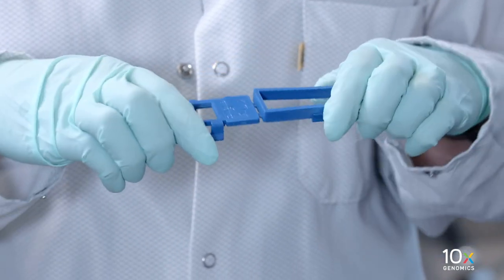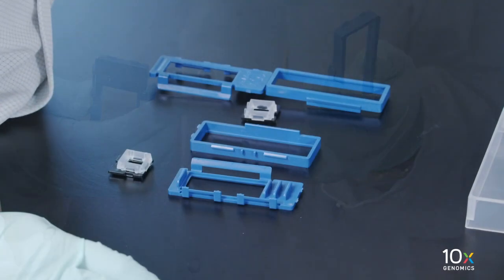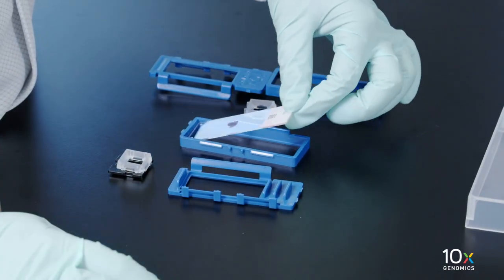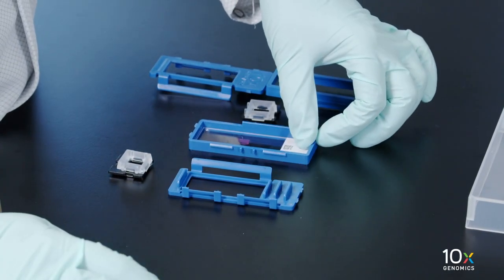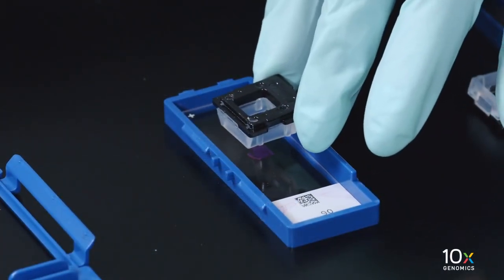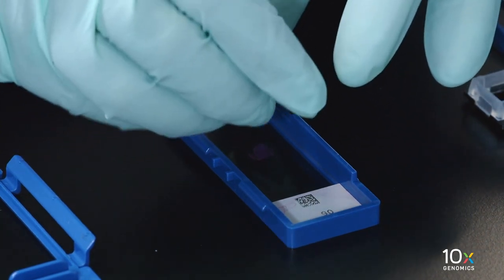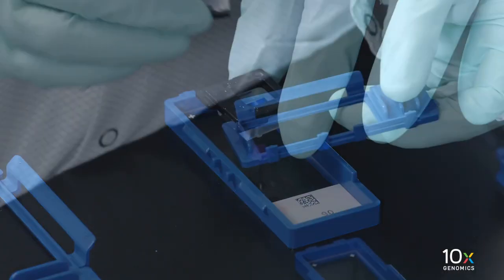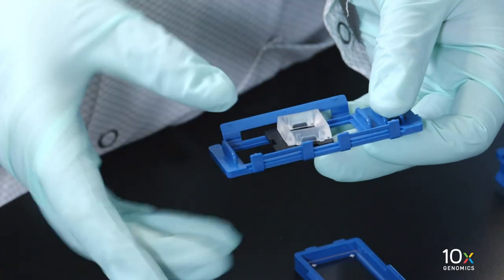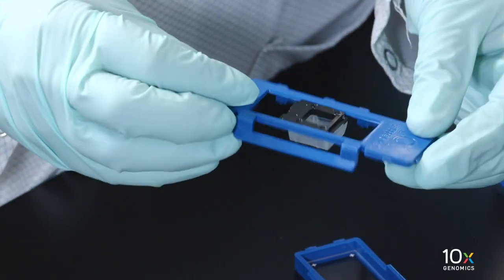Pull apart the hinges of the upper and lower halves of the cassette. Place the Tissue Slide into the lower half of the cassette with the tissue facing toward you. Determine the gasket orientation to center the tissue. The 11 millimeter gasket can be rotated in four directions. Securely combine the gasket with the top half of the Tissue Slide Cassette until the gasket snaps into place.